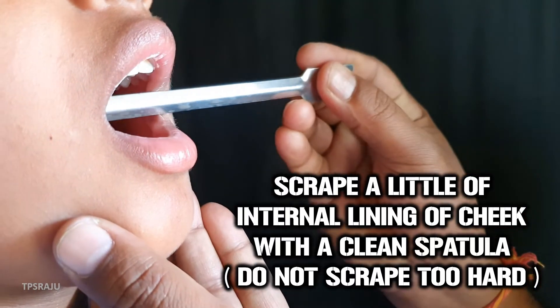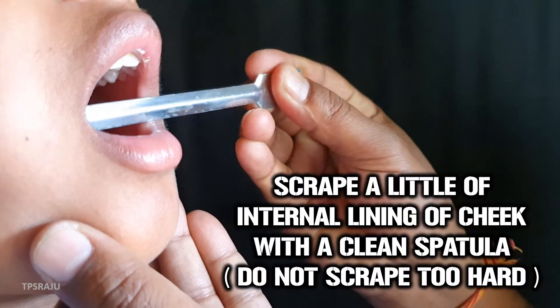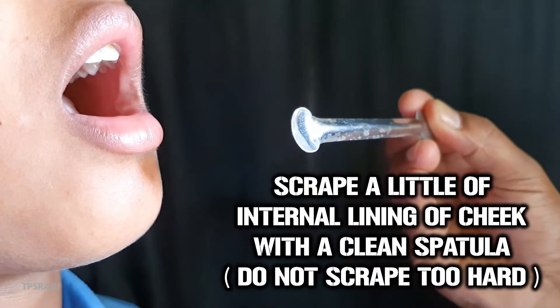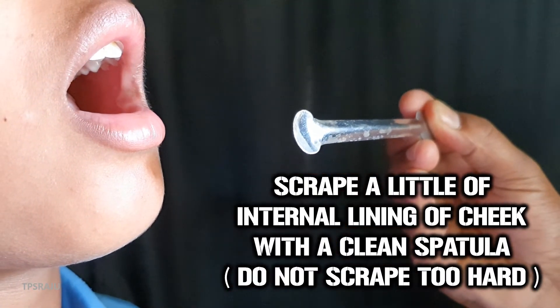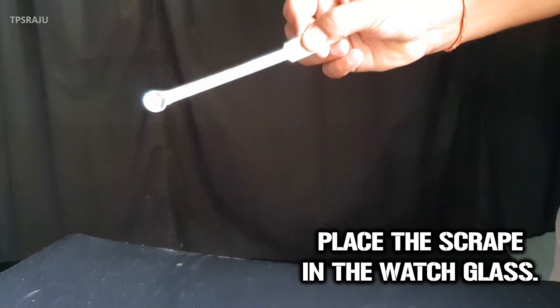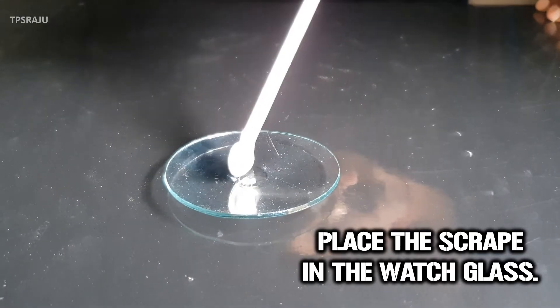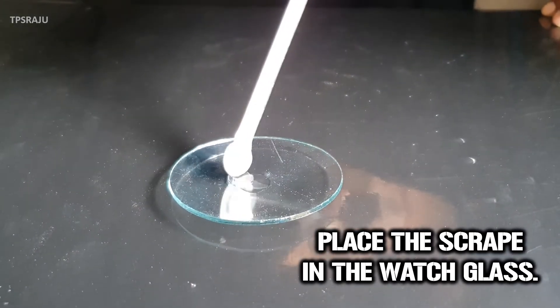Then, carefully scrape a little of the internal lining of the cheek with a clean spatula. Do not scrape the cheek too hard as it may injure. Place the scraping in the watch glass containing saline.